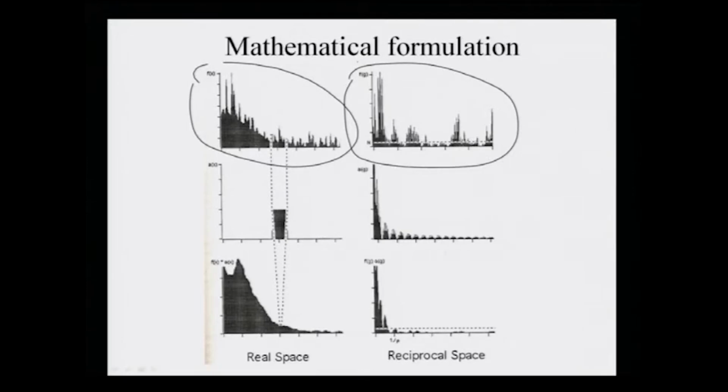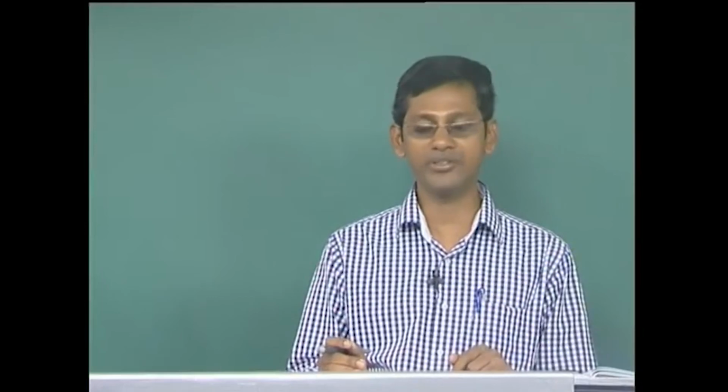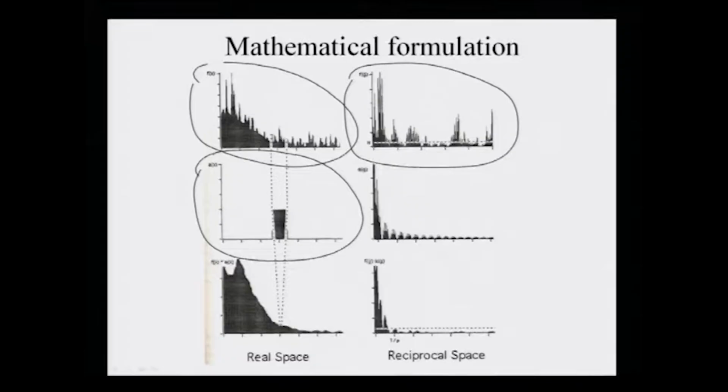So, therefore, everything is a function of frequency, and we can say the aperture function is like this, as shown in this picture. The aperture function is 1 in the aperture and 0 everywhere else, because this is a small hole through which the light is passing. Any place outside this small hole, light is unable to pass through, therefore we can assume this will be 1 in the aperture and 0 in other places. And if I Fourier transform this, it again gives me a lot of peaks.